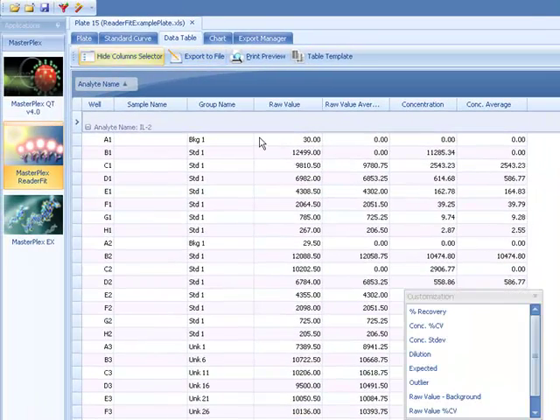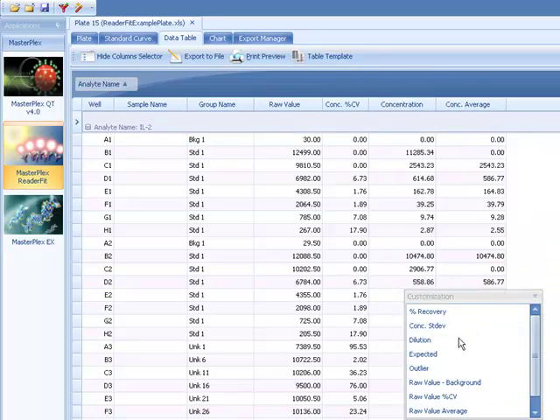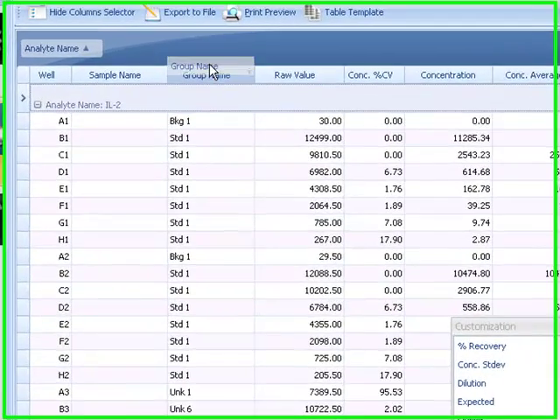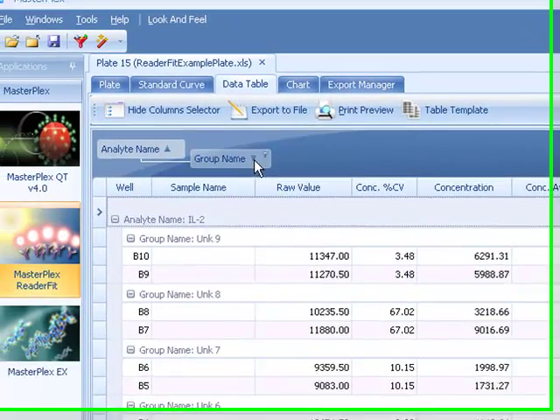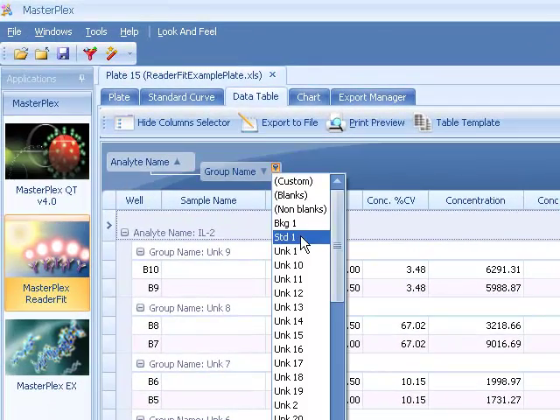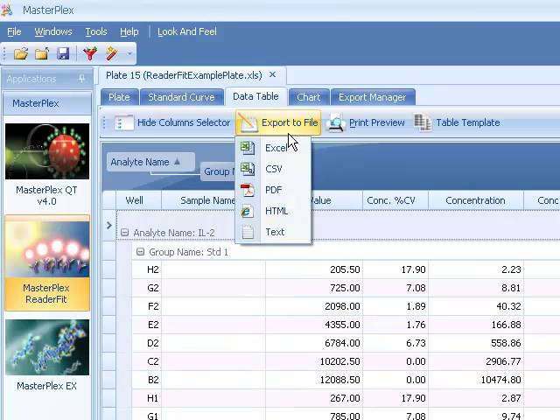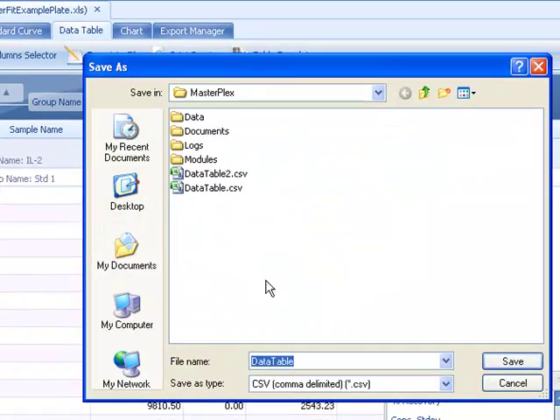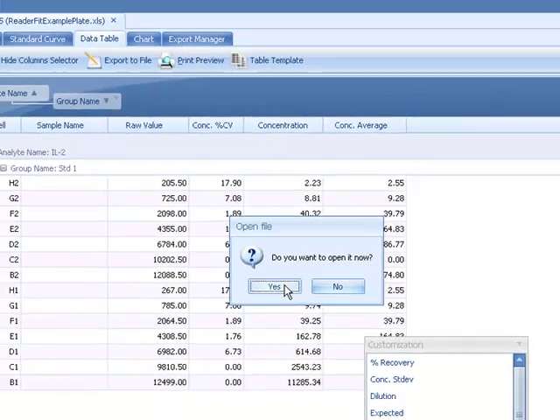A powerful and easy to use drag and drop interface allows you to create custom report formats. Take advantage of the sorting and filtering features of this flexible report generator. Export to many file formats instantly. Save report templates for future use.